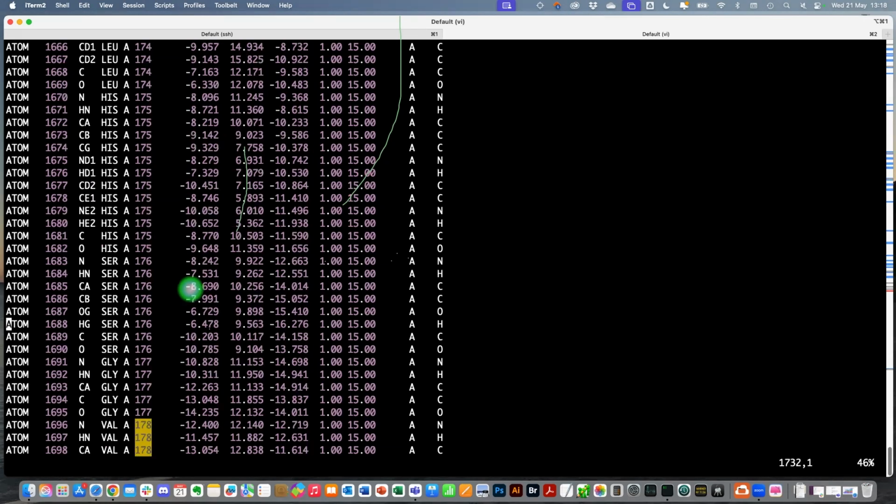So we have a lot of tutorials for different scenarios, basically. And for HADDOCK3, is there a way we can use the same as HADDOCK2? The server, no, there is no, because that's also using the grid, so you need a passport for the grid. We're using these X509 certificates, and HADDOCK3 doesn't have yet a running mode that will be able to submit to the grid.